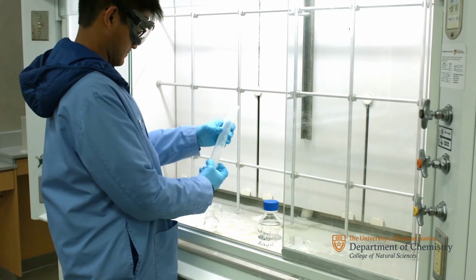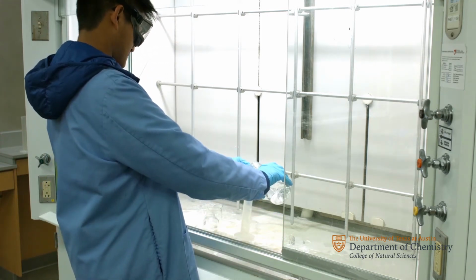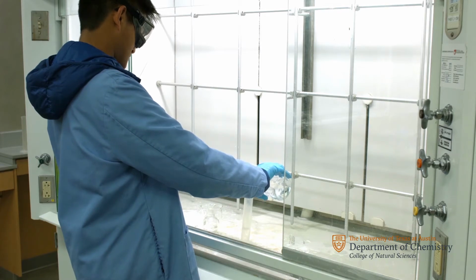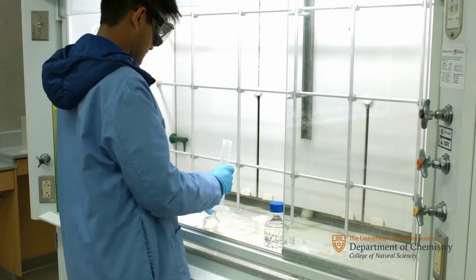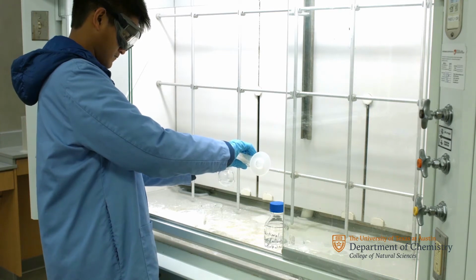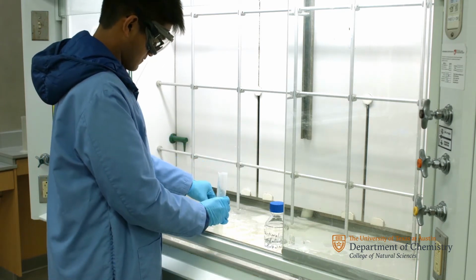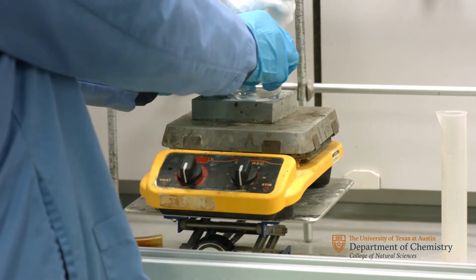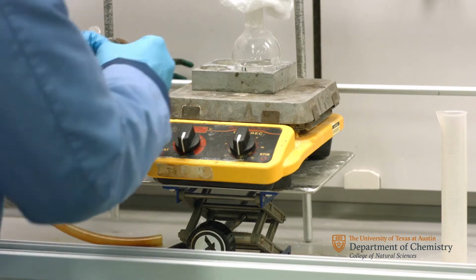Once your TA has given you the OK, go to the sample hood and pour out 30 milliliters of the unknown into your 100 milliliter graduated cylinder. Then pour it into your 100 milliliter round bottom flask. You can use a large beaker to transfer the flask to and from your own hood. Place the flask back onto the hot plate and re-secure it to the column. Make sure to put a Keck clamp on it this time.